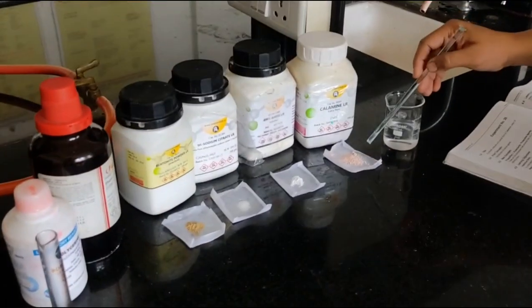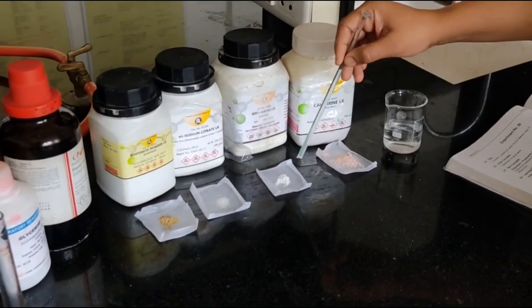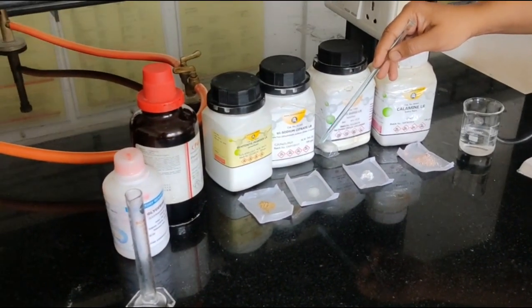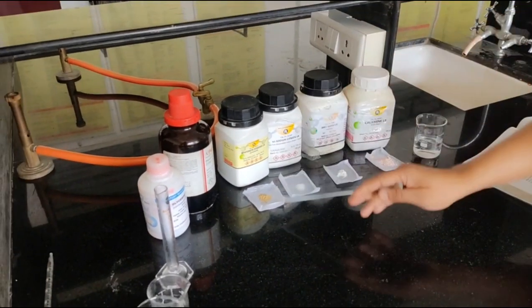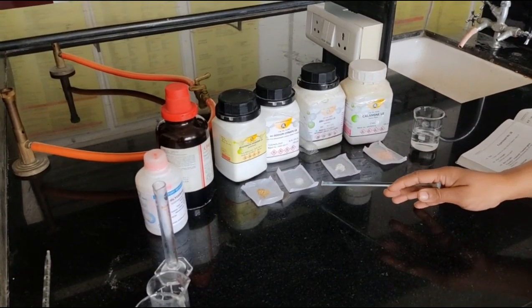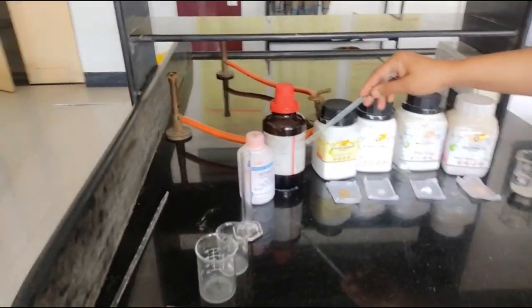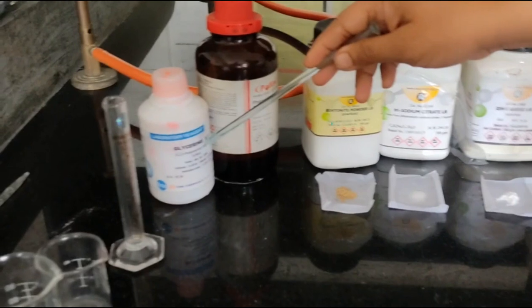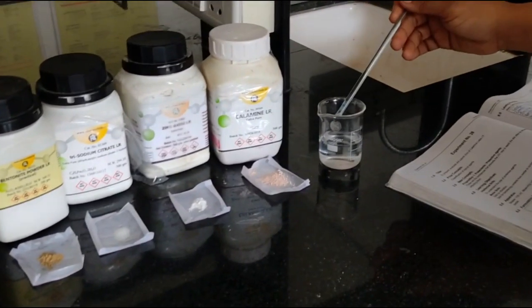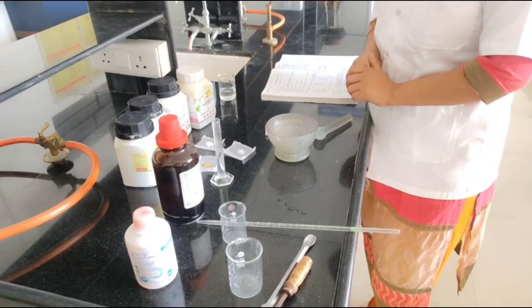We have to prepare only 10 grams. That's why our required quantities are 1.5 gram of calamine, 0.5 gram of zinc oxide, bentonite 0.3 gram and sodium citrate 0.05 gram, and we require liquefied phenol 0.05 ml, glycerin 0.5 ml and purified water QS. Now let's start how to prepare the calamine lotion.